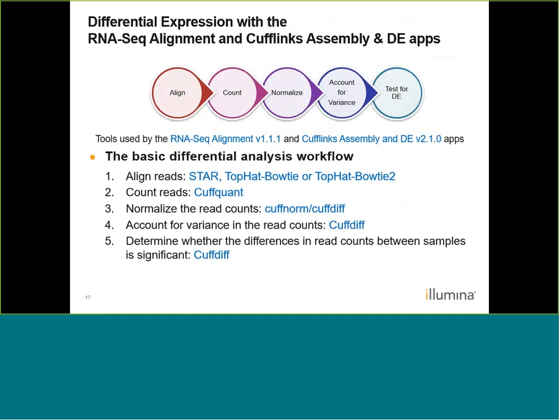Next, we're going to count reads using the CuffQuant app, the CuffQuant tool inside of the app. Then our normalization is going to be using CuffNorm and CuffDiff. We're going to account for variance with CuffDiff, and then we're going to determine differential expression significance with CuffDiff.